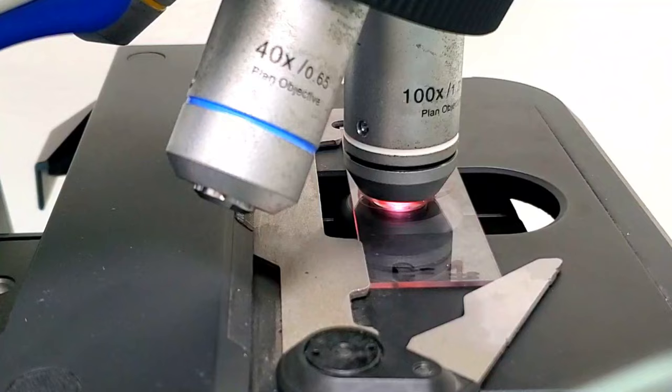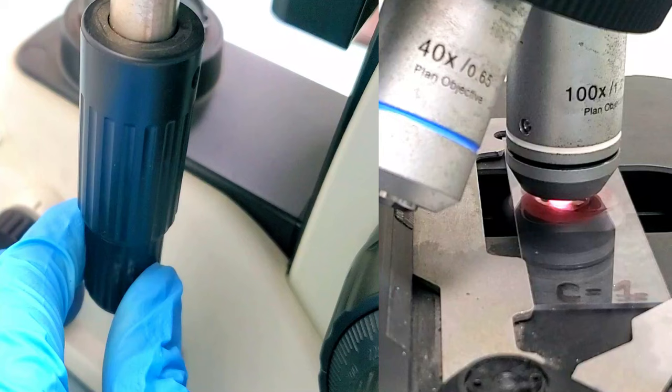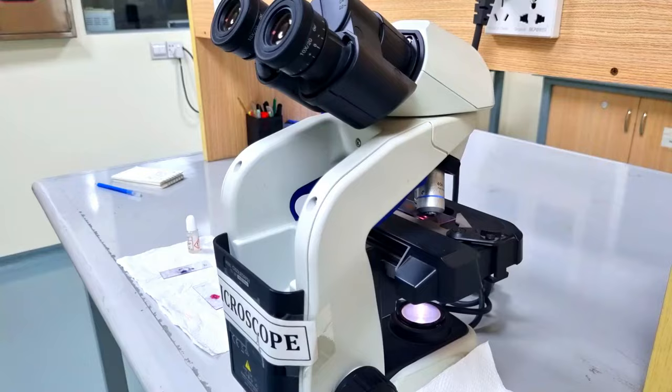Adjustment should be done side by side, up and down, so that a good microscopic field can be obtained. For better viewing under the microscope, adjust the microscopic field and light intensity and do fine tuning for clear visualization.